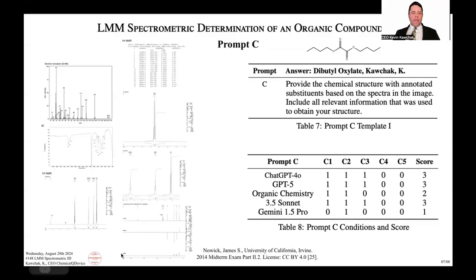So, in the DEPT spectra, we see here the three CH2s. Okay. I think this is the 135 DEPT, CH2, CH2, CH2, and then the CH3 being up. So the 3 CH2s being down, and then the last methyl being up. Okay. So, like I said, it's not the easiest problem, but I would say it's definitely harder than the other two. The 2 main things, if you can't get the symmetry.